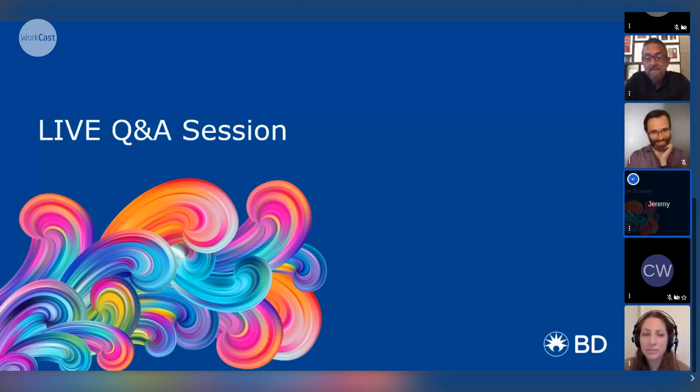Thank you. So the next question, and this one, Rui, I will direct to you, is someone is asking how to properly set up their instrument settings on a PMT, and how does this impact their resolution? In a what? Sorry, I didn't get that. Right. So the question was how to properly set up their instrument settings, and how does this impact resolution in regards to PMTs?